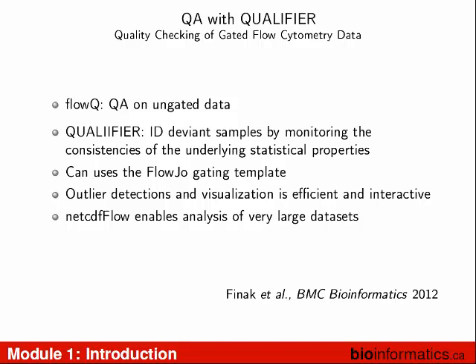But that's going to be changing. As I mentioned, we just came out with a standard called GatingML. We published on that, and right now we're writing a reference implementation in R, so that all these software developers can see how to exchange gates between software tools. I think this is going to be fantastic. You can take FlowJo and read it in FCS Express, or read it in DIVA. BD has said yes, we're going to follow the GatingML standard in our next version of software, so they'll write out GatingML files, and then you can take those files that you analyze in DIVA and read them into FlowJo, because FlowJo already supports an early version of GatingML. So we're getting there. Things are changing. It takes time, and it's painful, but it's a good time to get into this space, because these problems are being solved.